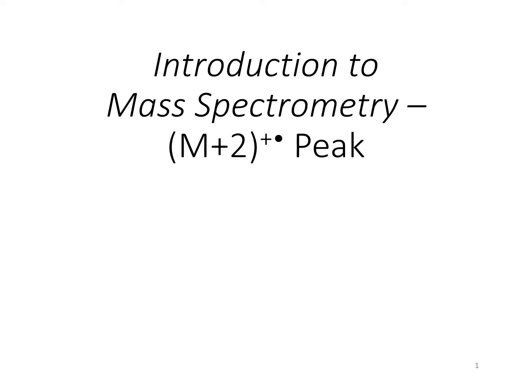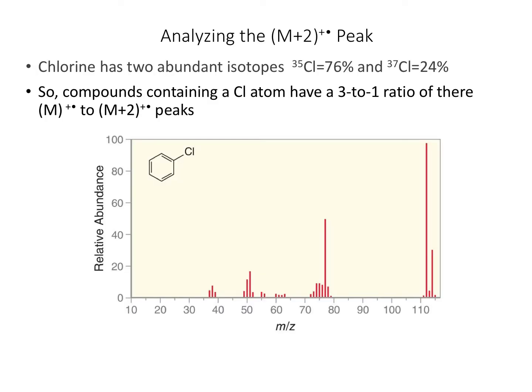Okay, this is going to be a pretty short video, and we're going to talk about the M+2 peak. So the M+2 peak doesn't appear in all mass spectra, but when it does, it can very quickly tell us some useful information.